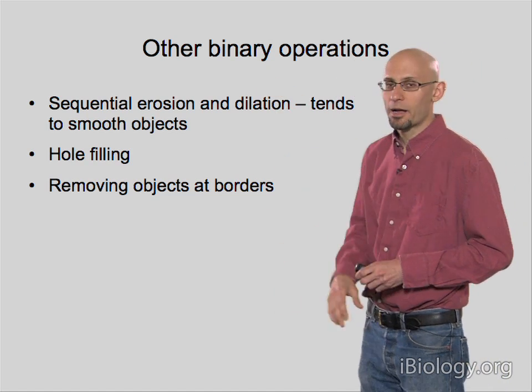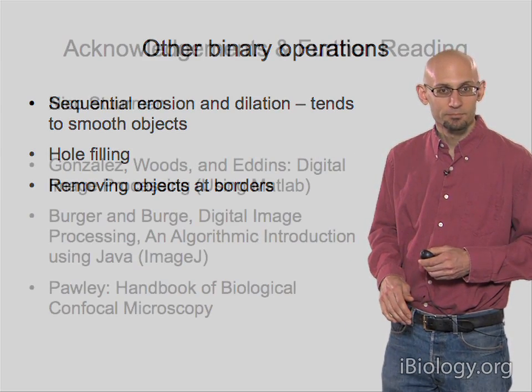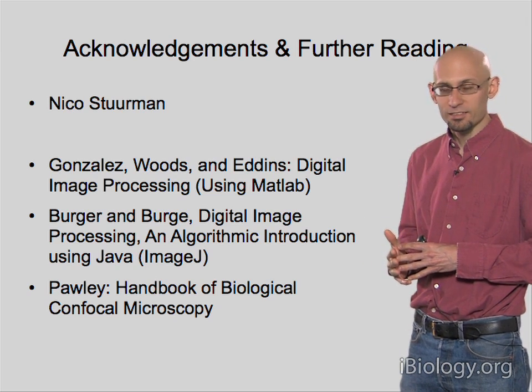So along with filtering, these binary operations are kind of a real workhorse in digital image analysis. And that's really all I wanted to say today. This is just designed to give you a taste of the tools that go into digital image analysis.